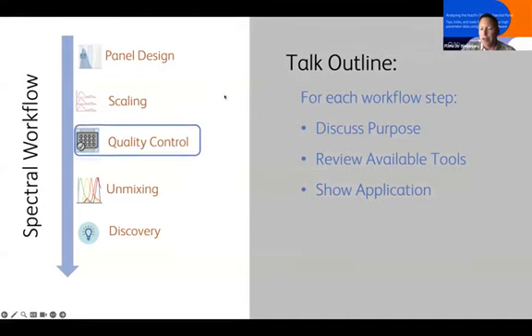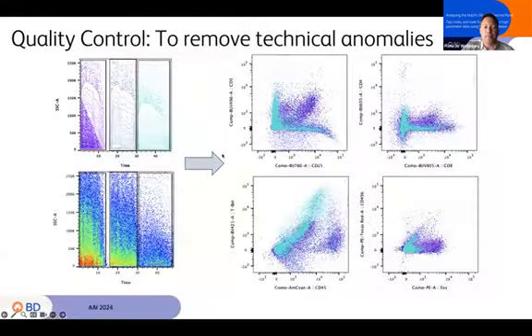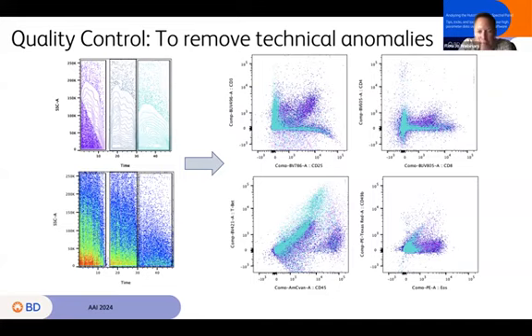Moving on to quality control. All right, so for each of these slides, I was attempting to give you a little why are we doing this, as well as going through an example and some of the mechanics. So this is my why for quality control, a slide that I pull up with some regularity because I just love it. It's a slide that shows an experiment that was collected by someone in a hurry.